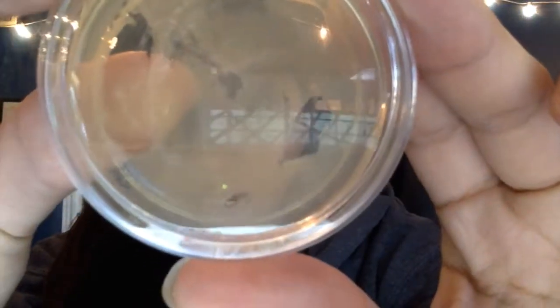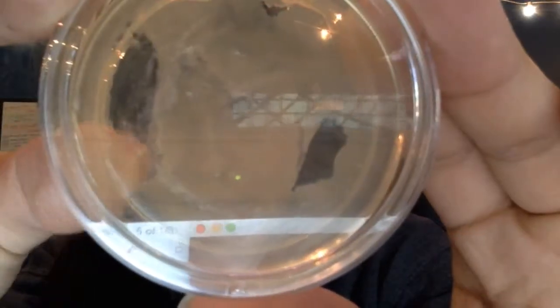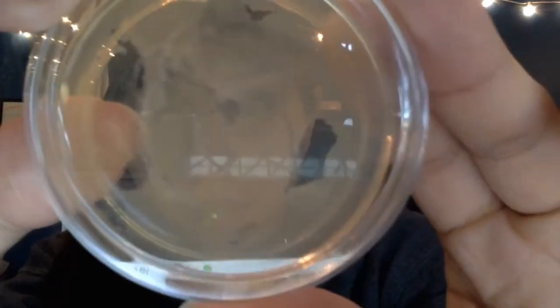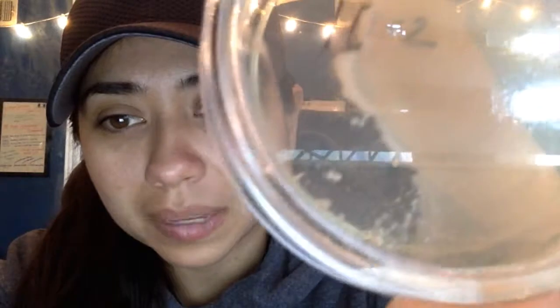So I'm going to start off by showing the first agar plate. So this is 10^-1. So this should be the least diluted plate. It's like more of a thick, filmy substance all over. Can't really count individual microorganisms here. So I'll show 10^-2. It's got that same part covering the majority of it, but here at the bottom we can see those different organisms I can count. So those would probably be the colonies that I could start counting.